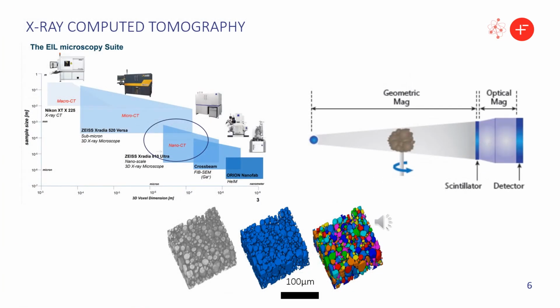Once our scans are complete, we can segment each phase as shown in this image. Here, a grayscale volume has been segmented into particles, and then each particle has been separated into a unique label field. This enables each individual particle to be characterized and can give an indication of the morphology of the electrode. Image segmentation and separation is not always perfect, and as such, machine learning is being utilized to improve the quality of these operations and enable more accurate results to be generated.